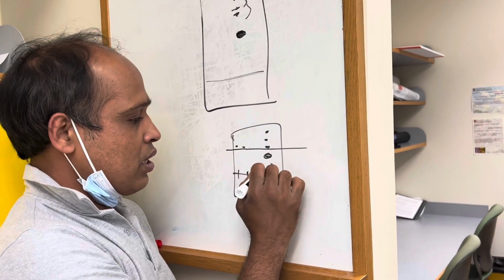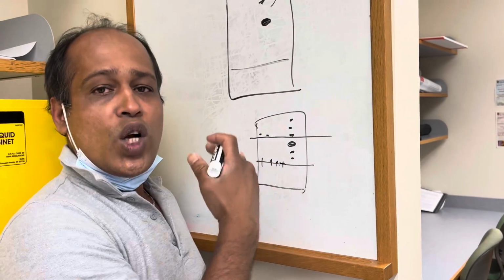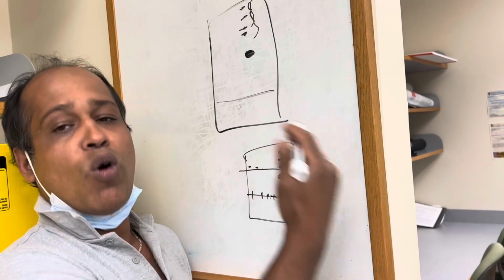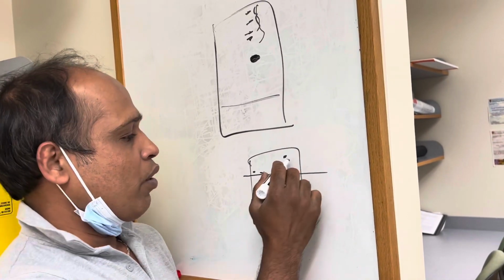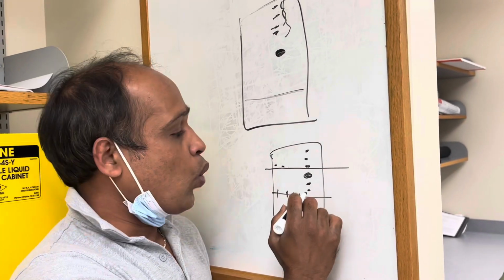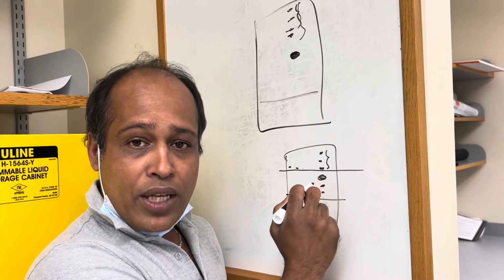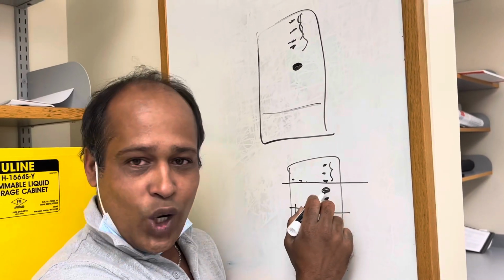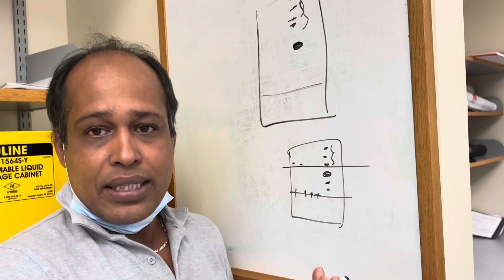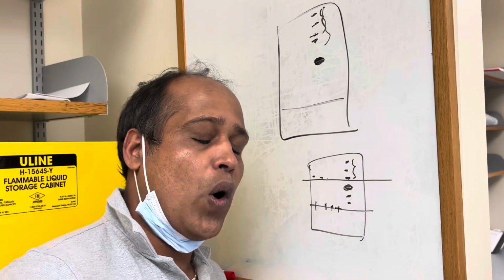But if you have something else there also, then do not immediately increase a lot of polarity. Just start adding more polar solvent, like if you are running 0%, then start 1% or 2%. Because while you're running with hexane only, remember that those spots are moving. That doesn't mean that spot is not moving, that also could move. So ideally, you do start off with 0%, but I would say it is not common for all kinds of compounds.